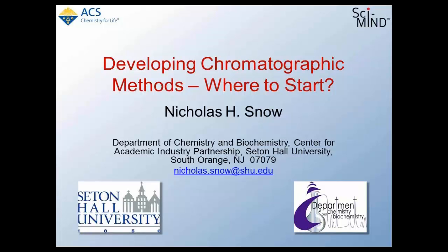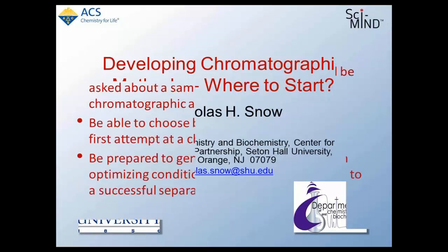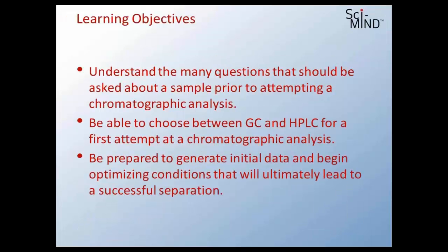So we'd like to talk about chromatographic method development today, and of course I think, as most of you know, that's a topic that we could do weeks and month-long and sometimes career-long learning about. I know after 25 years I'm still learning new things about method development, and certainly every time I talk with a colleague about method development in chromatography I learn something. So we've got a lot of work to do, but we'll get started today a little bit. Think a little bit today about all the kinds of questions that we want to ask before going into the lab.